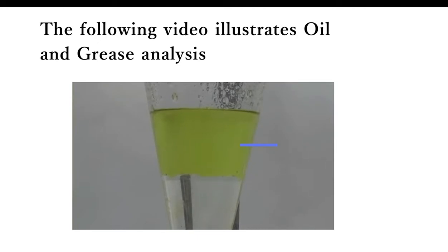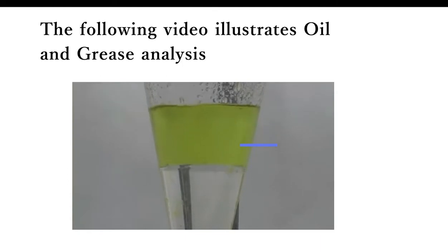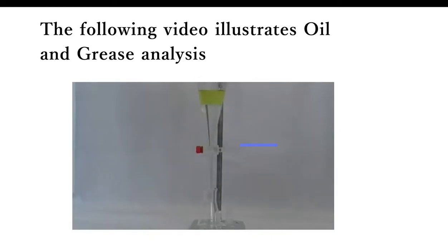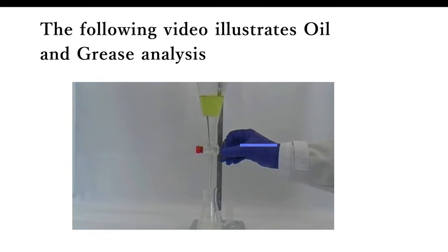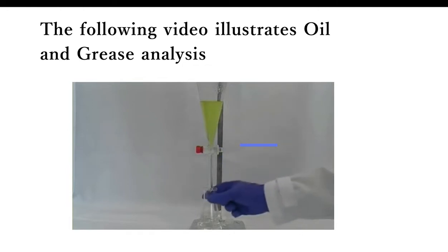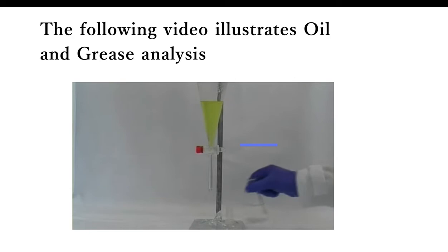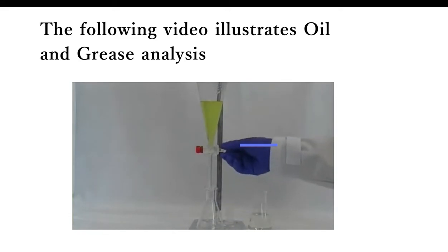After the phases have separated, you may face the question: which is the organic and which is the aqueous phase? A simple way to test is to add a little of the aqueous phase at the top and watch whether it runs through the top layer or is collected in it. In this example it ran through, so the aqueous phase was the bottom layer. Be aware that it may not always be an aqueous vs. organic situation — it could be two immiscible organic phases. In any case, keep both phases in separate conical flasks until you are certain which contains your desired solute.